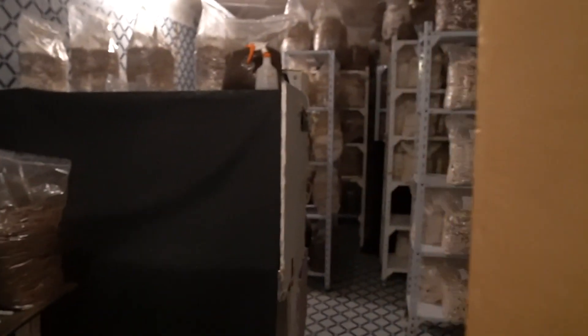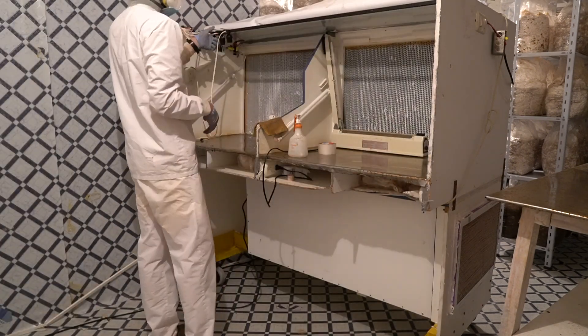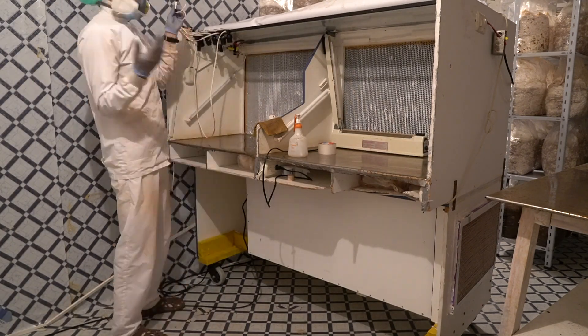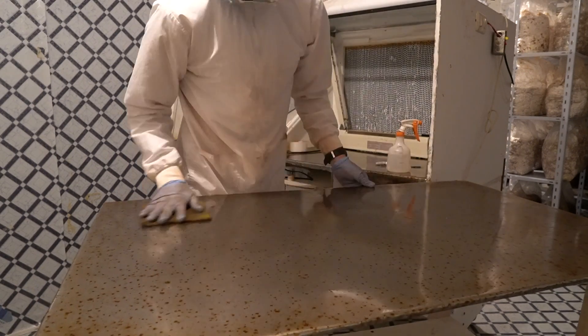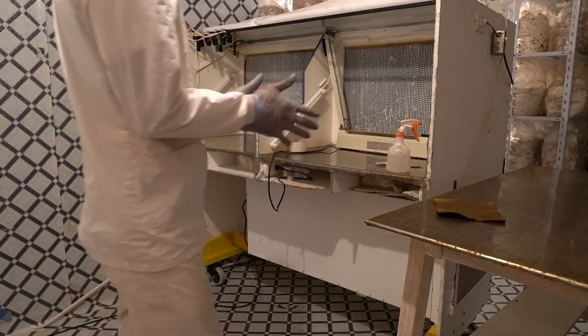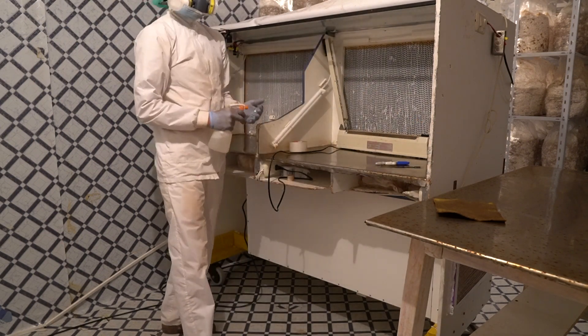Welcome to my laboratory! We are growing shiitakes mainly. I have UV lights on a timer that operate and kill things while I sleep, and I spray everything down with alcohol to start — rub down the table, then turn on the flow hood and get things cranking as soon as possible.